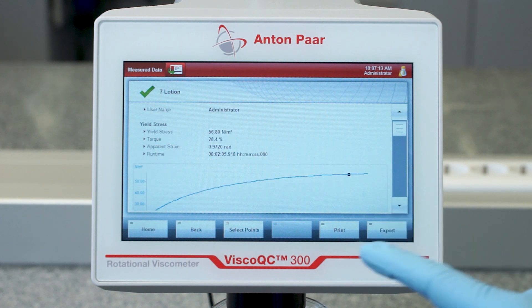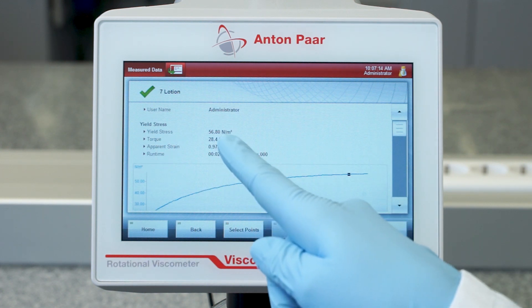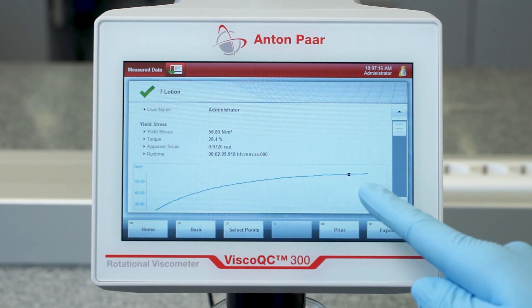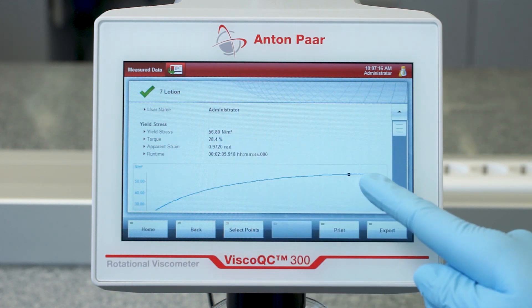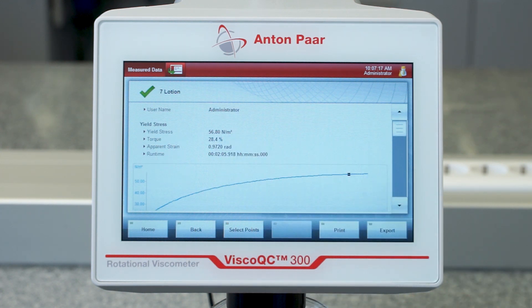Knowing the yield stress is useful to determine the force that needs to be applied to a sample so that it starts to flow. For instance, if you want to apply some hand cream, it tells you how much force you need to squeeze it out of the tube.